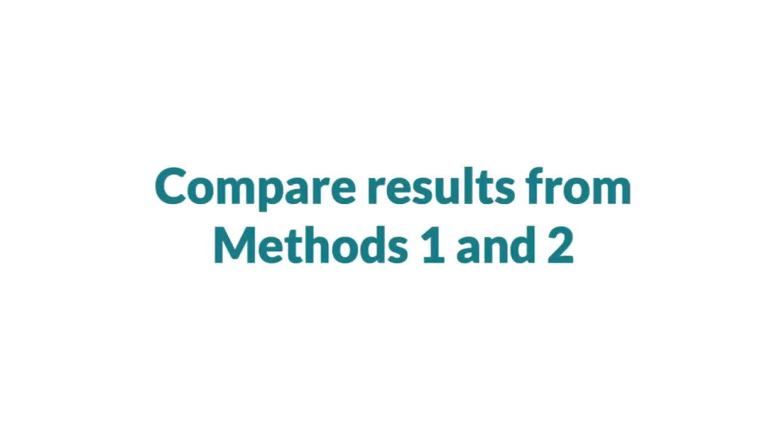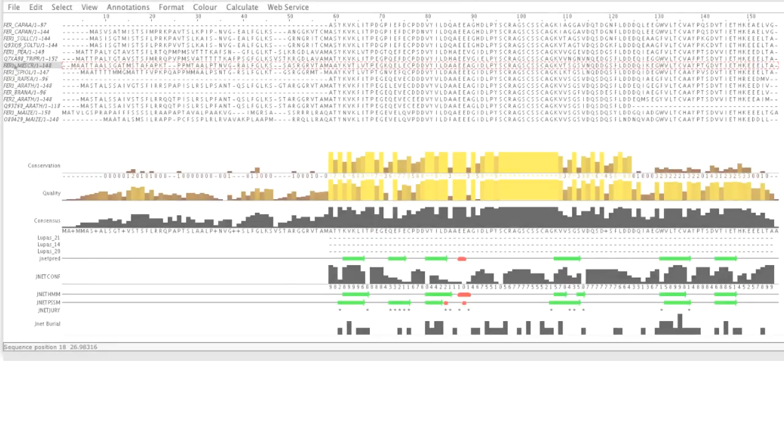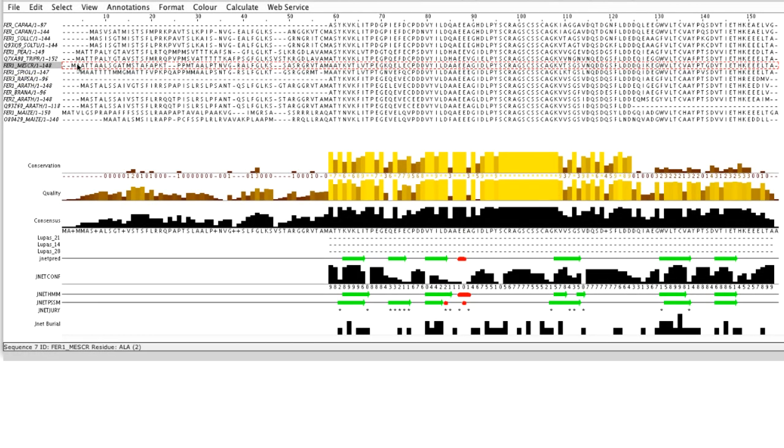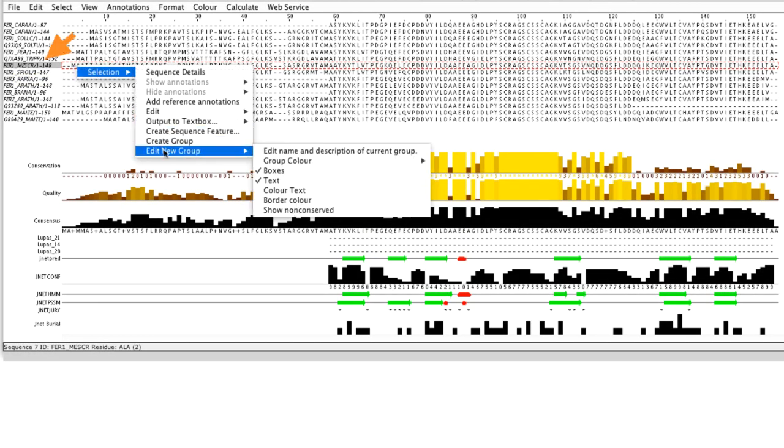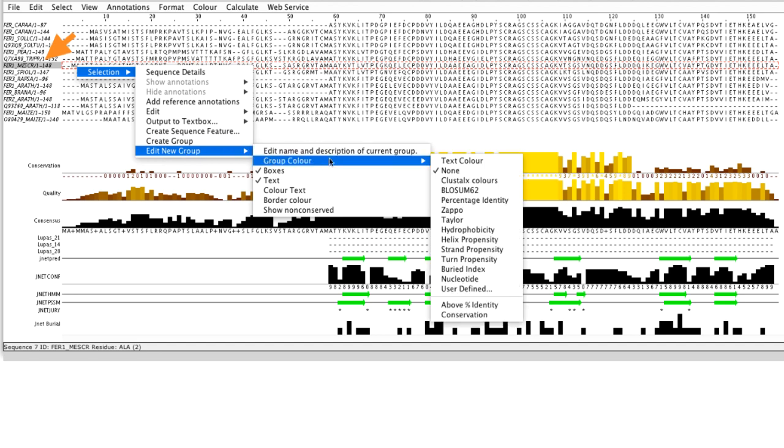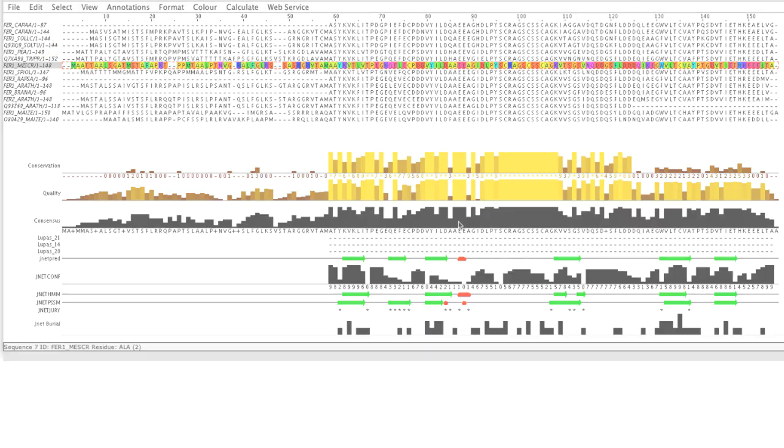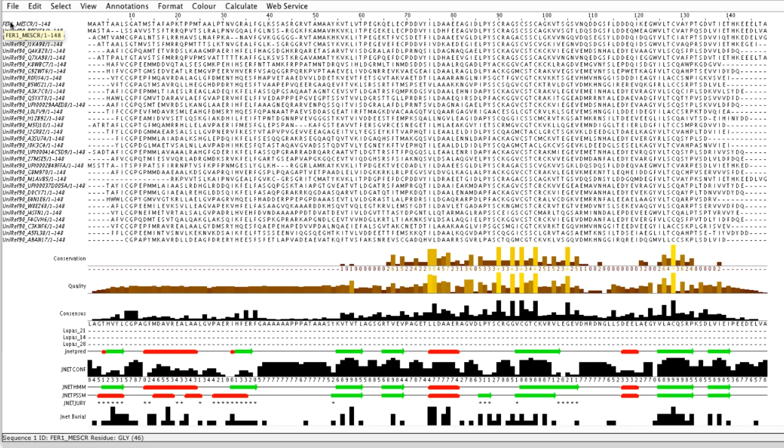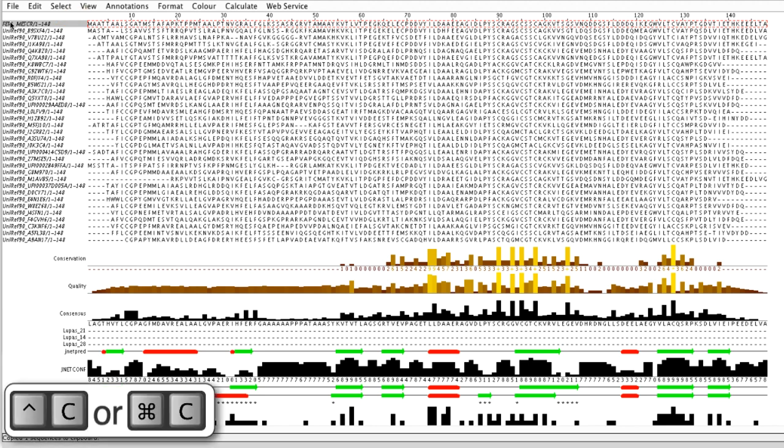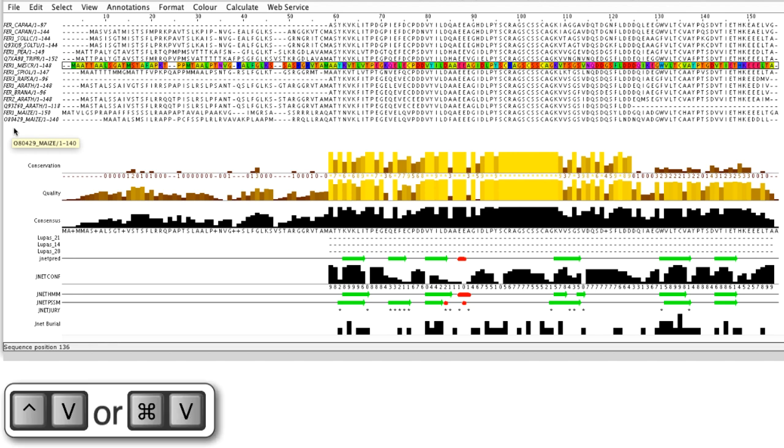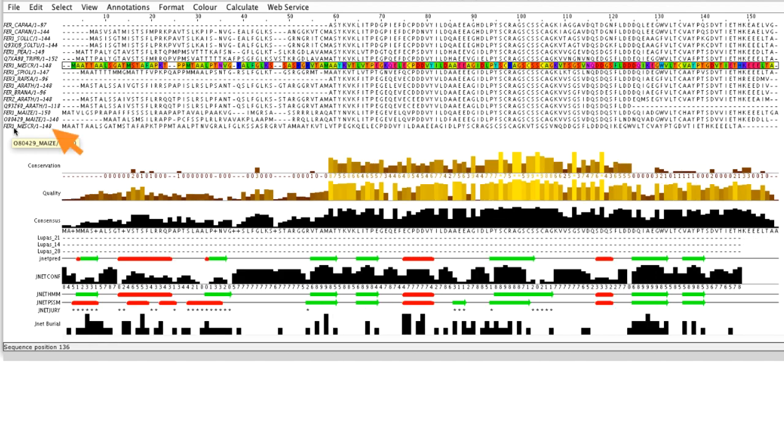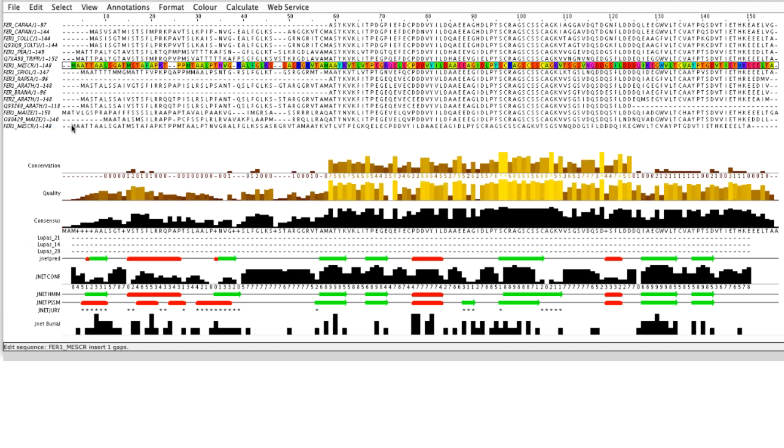Let us compare our two results. In the second prediction window, I will highlight the sequence that was used to generate the first full JPRED prediction that involved the PSI-BLAST step. Back in the first prediction window, I will copy this sequence using the CTRL or CMD C. And I will paste the sequence onto the alignment window of the second prediction using CTRL or CMD V.